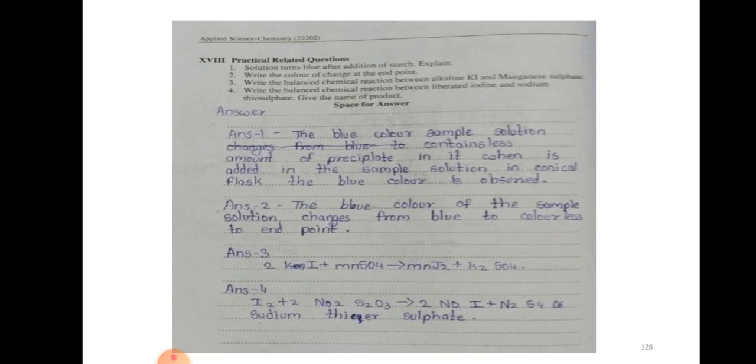Here I have written it. Solution turns blue after addition of starch. Why? As the iodine is liberated, that is why solution turns blue. Which color changes at the end point? At the end point, solution changes color from blue to colorless. Balance chemical reactions we already explained in theoretical background. Here I already written. Question number 3, 4, answers are given.